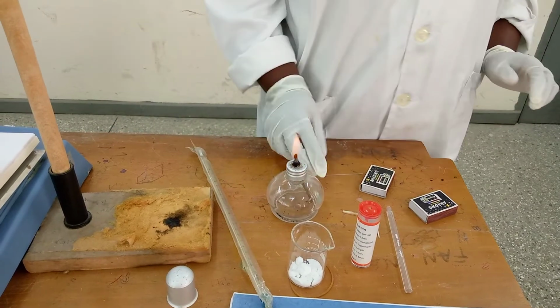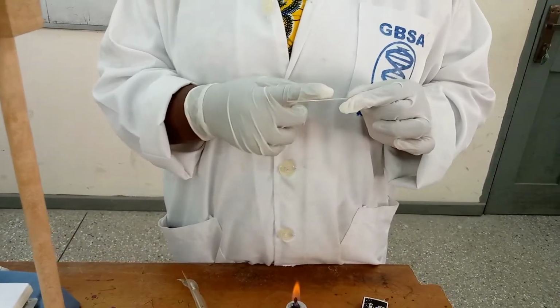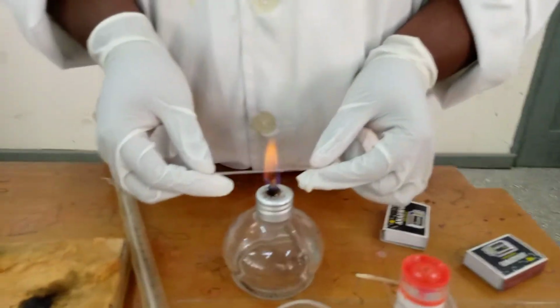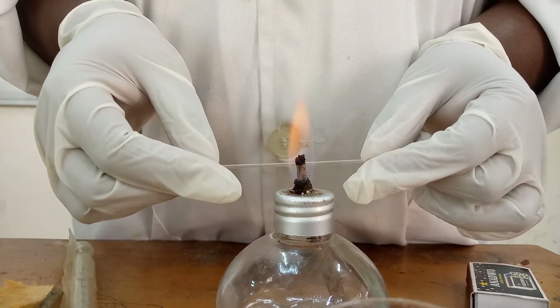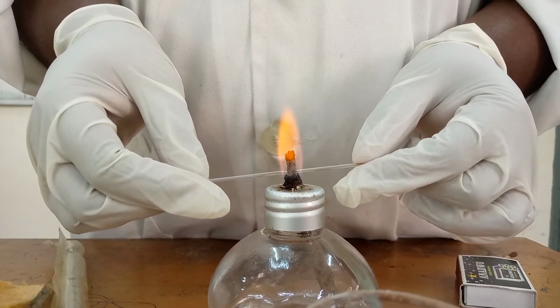Okay. So what I'll do is I'll hold both open ends like this. Then the middle part of the capillary tube, I will send it close to the blue flame of the lamp. So the blue flame of the lamp, that is what I'm taking the capillary tube to. So you have to wait for the glass to melt.